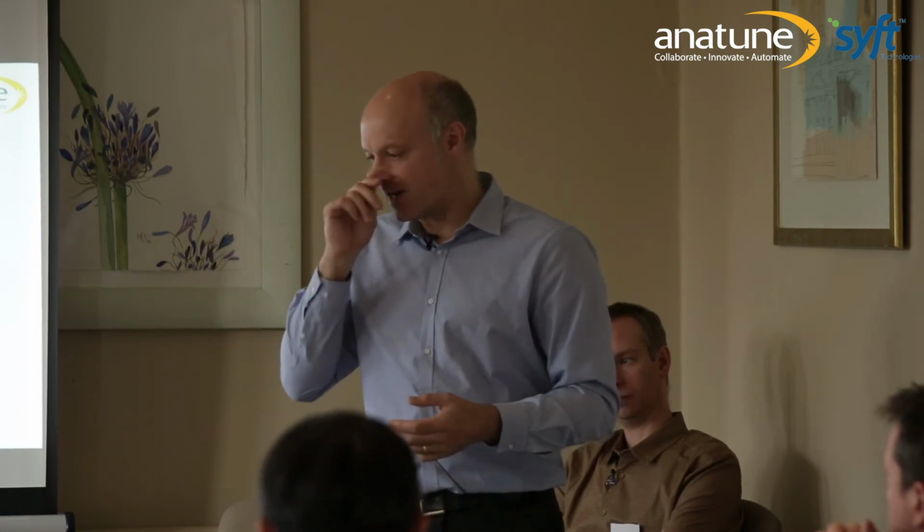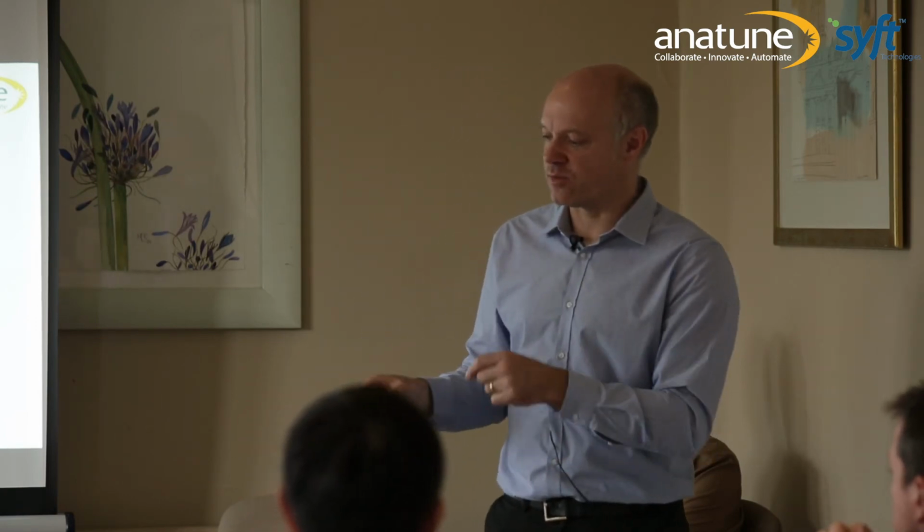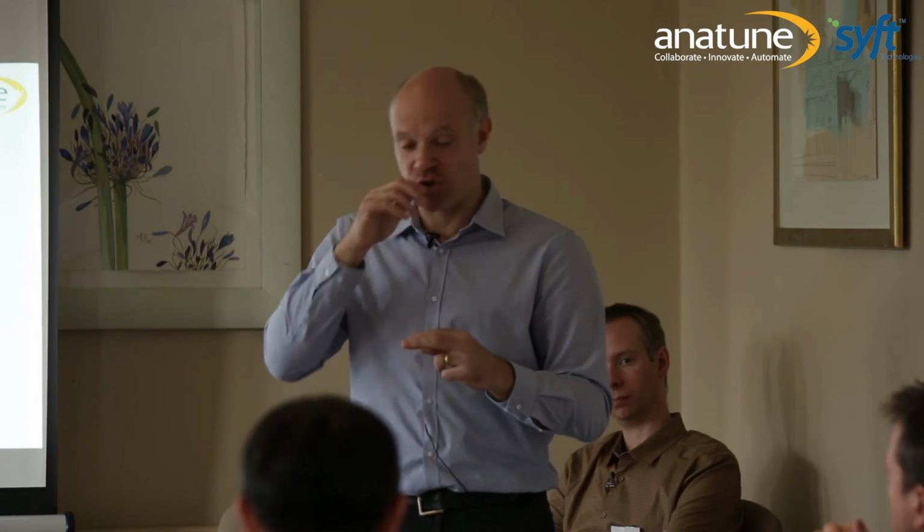I think one of the things to say about the specificity is that what we have going for us with SIFT-MS is that because we can use the multiple reagent ions, it actually will throw up matrix interferences relatively easily, because if you use 2 reagent ions to measure, or 2 product ions to measure the same concentration, if one's got an interference, you'd hope that you wouldn't get interference in both in the same way. You would find that deviation in measured concentration, and then it's up to you to decide what's going on.